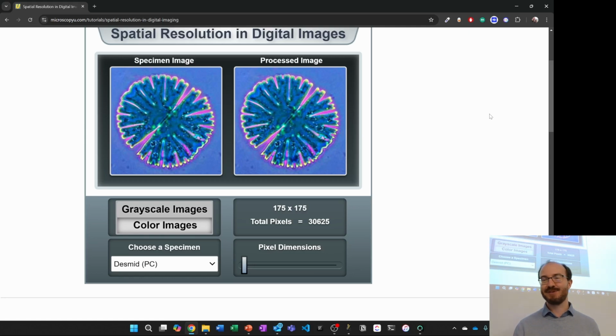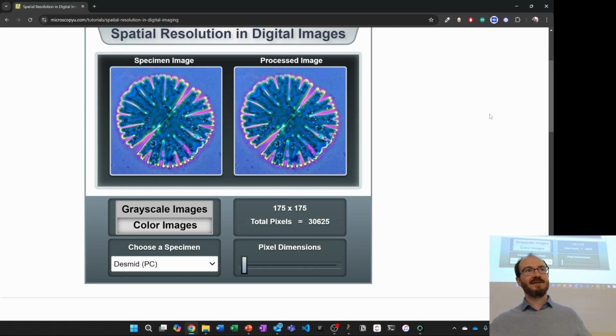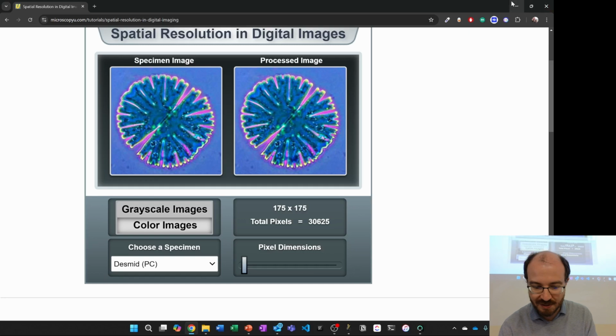So you don't want to actually capture necessarily at the highest resolution, because you want to capture a long lifetime time-lapse sequence, and you need to then do it much quicker. So you reduce your spatial resolution, but you know that there is a little bit of a price that you pay. So just all of these trade-offs, always good to consider.